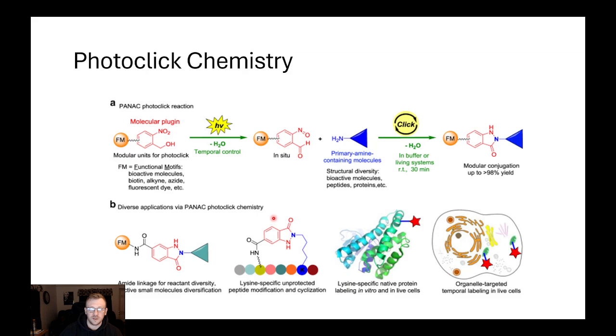So if we know that we have some RNA strand that's being expressed inside of our cell, say it comes from a virus, and we have a motif on that virus that we think we know, we can go ahead and build an activator that's meant to target that RNA strand using lysines and actually start labeling invaders inside of a cell, for example. And then we can also do that same thing with lysines using just protein backbones, right?